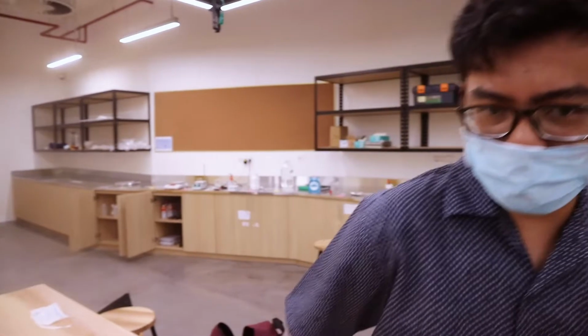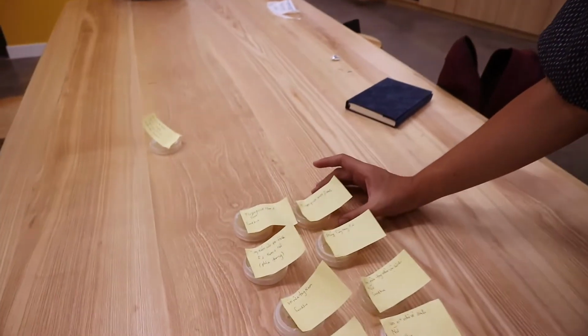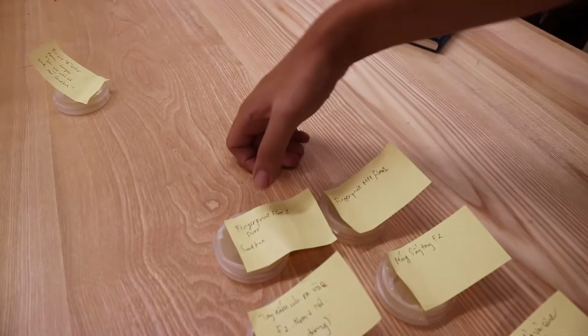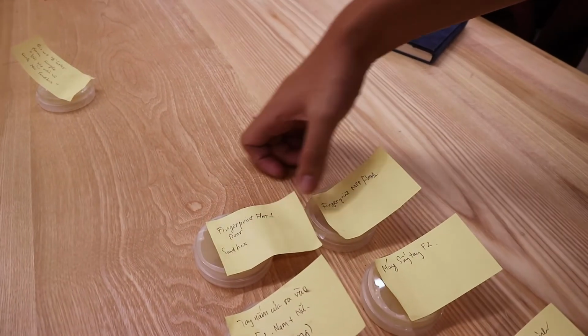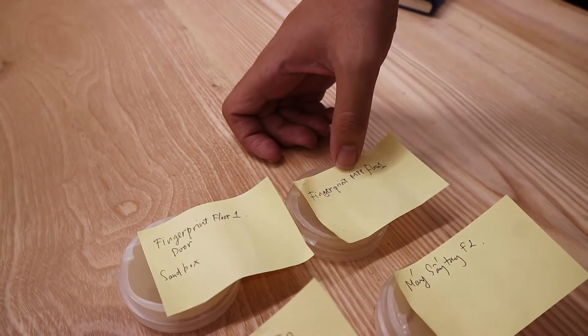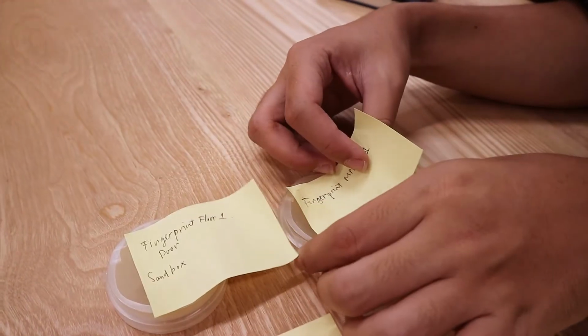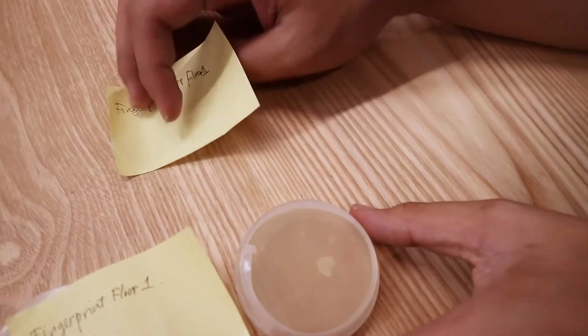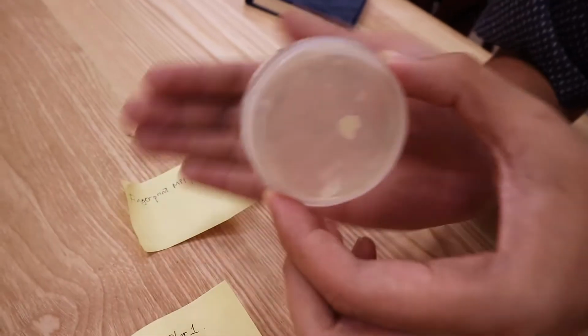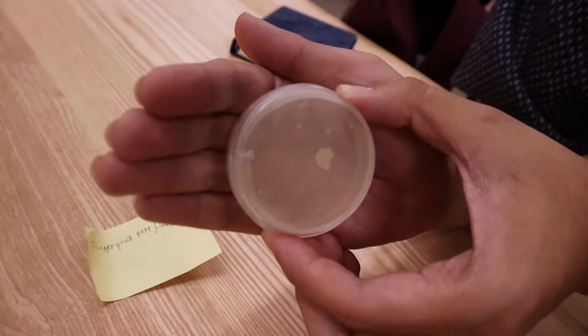As you remember, we have prepared samples from 8 different places yesterday, and let's see in comparison how these have grown. We juxtapose in pairs the fingerprint scanner on the first floor and of the sandbox area, and then the fingerprint of the new area made for MVP learner. Excited? Let's see this first. Wow, they must be very clean. You look. Yeah. There's only one very small spot here.